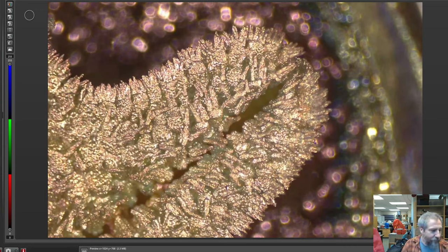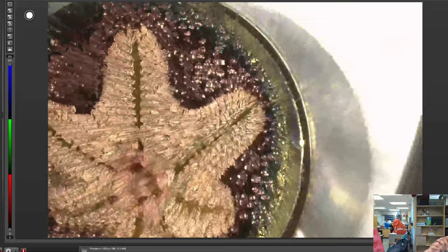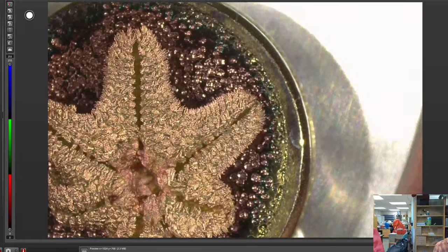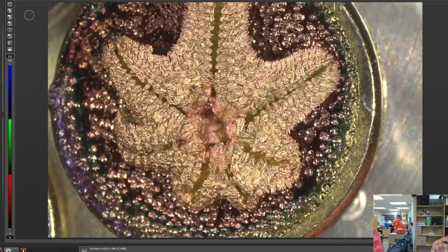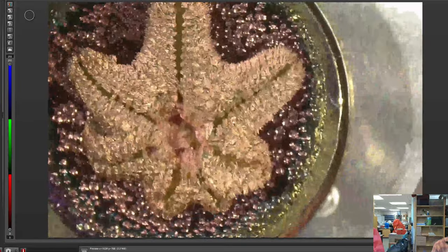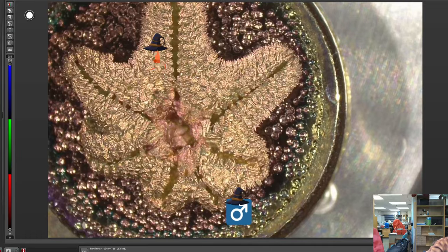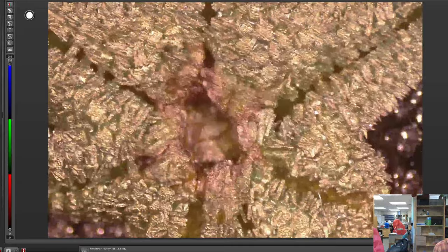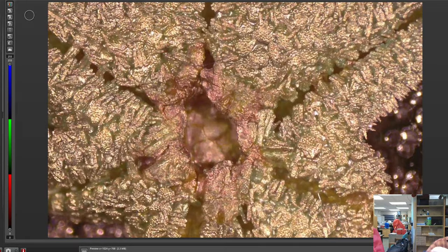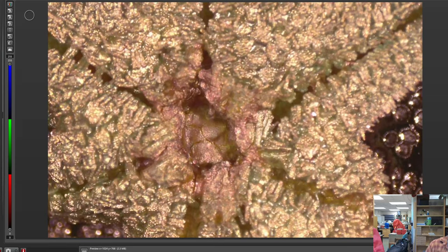So I'll zoom out, and then you can look at the sea star in its zoomed out state. It's actually kind of cool. You can see a little bit more than what we could see in the center part from the SEM, because once it got inside where the mouth is, in the middle, the SEM couldn't see into this very easily because electrons have a hard time escaping from this cave that we're inside focally right there.